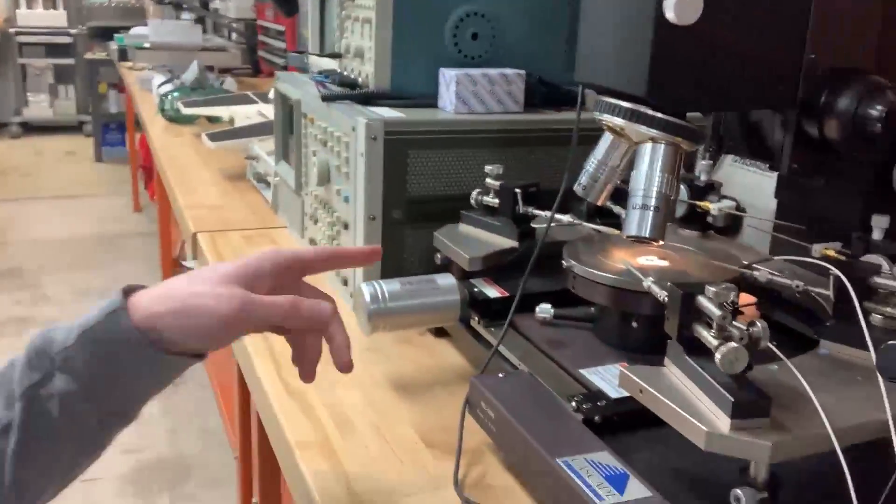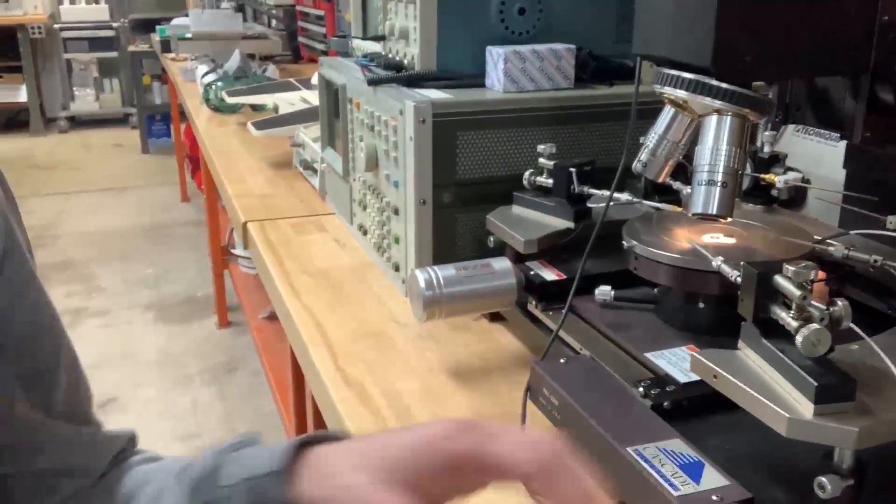Next steps for this are kind of obvious. If I can motorize this xy stage here or put it on like a 3d printer or something then I should be able to make 3d topology maps of the surface which would be super cool. And I could put a wafer in it and see how uniform the spin coating process is and compared to like how good it is in industry which is supposedly on the order of like angstroms, like actual within a few atomic layers across the wafer surface which is amazing.